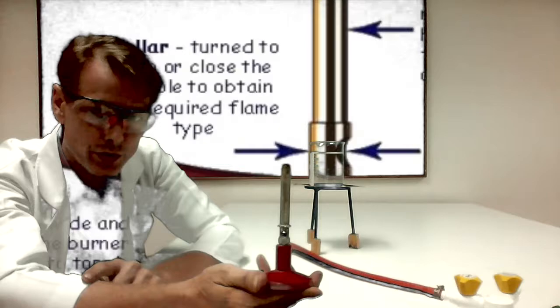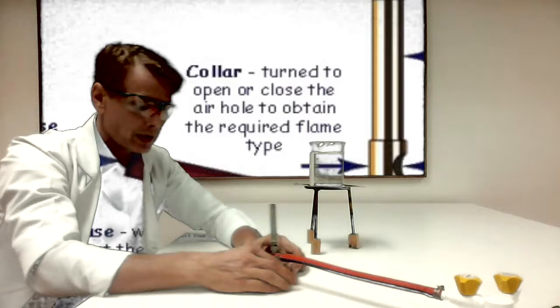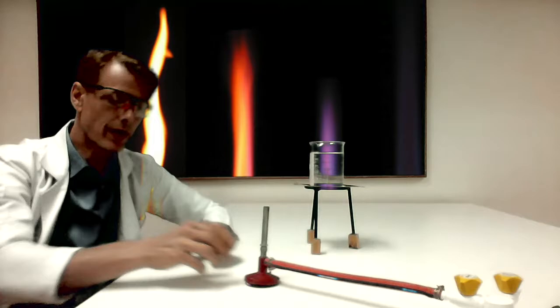You see that little hole right there? You should close it by closing the collar. You will see that you can close it. I'll let you witness it being closed, right? You close it so that it doesn't allow oxygen to fill. Then what's going to happen? What do you think is going to happen? Now that no oxygen can come through, what's going to happen? Is it going to be a bright orange luminous flame or a non-luminous flame? What do you think?